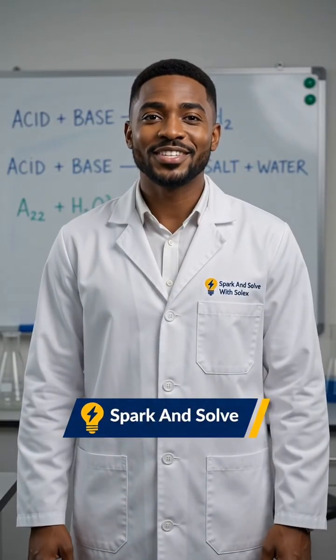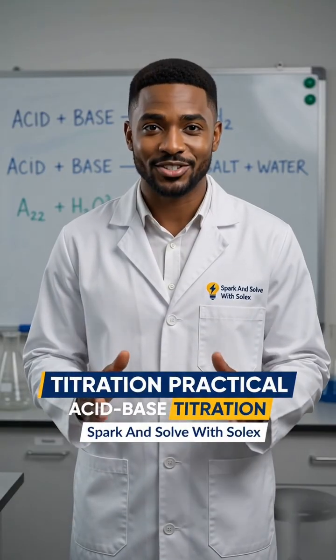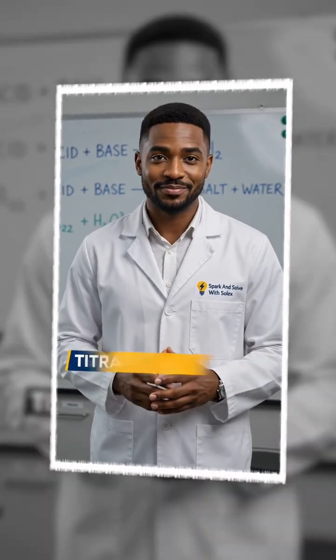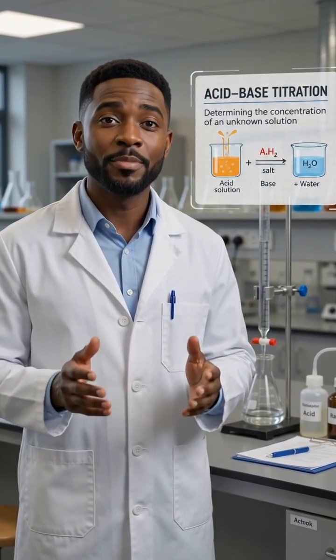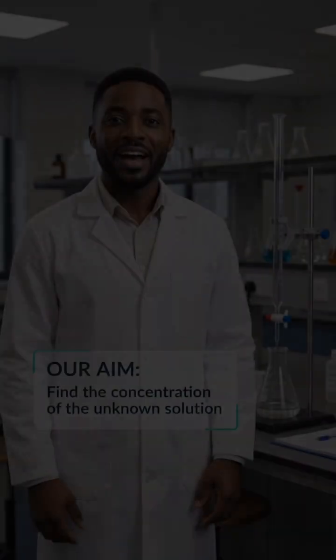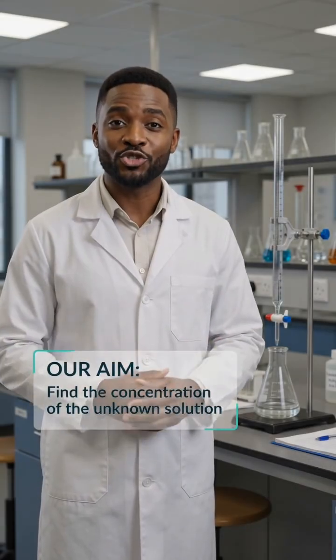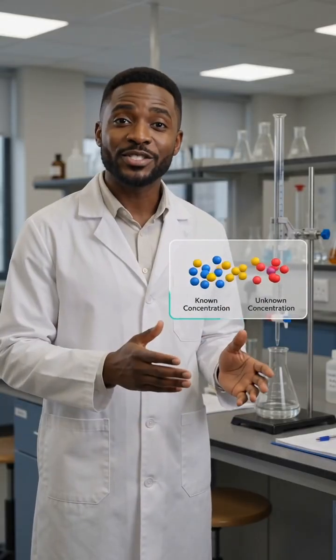Today, we're stepping into the chemistry lab to perform one of the most important practicals you need to master: acid-base titration. In this practical, we'll use acid-base titration to determine the concentration of an unknown solution accurately. Our goal is to find the concentration of the unknown solution by reacting it with a solution of known concentration.